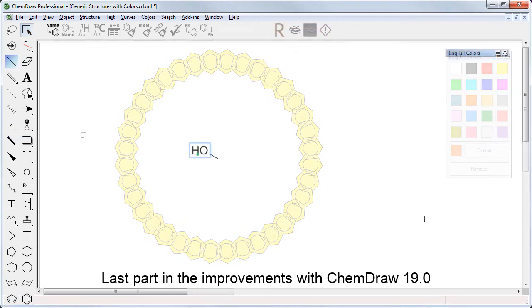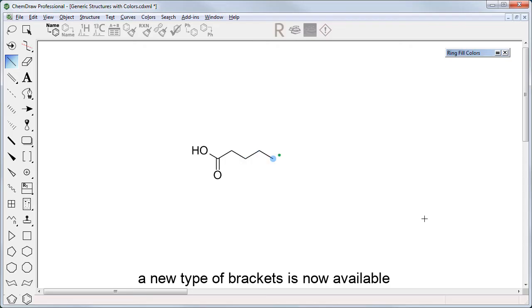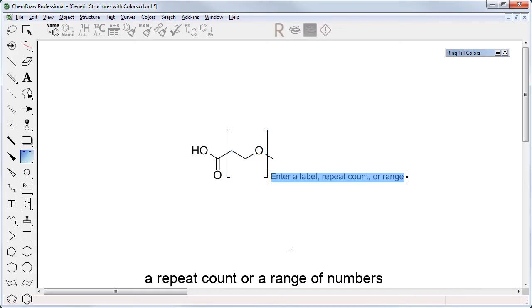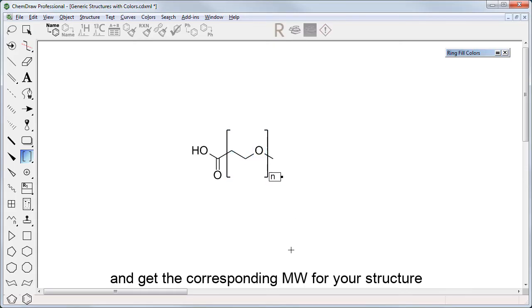Last part in the improvements for ChemDraw 19, a new type of brackets is now available, where you can enter either text, a repeat count, or a range of numbers and get the corresponding molecular weight for your structure.